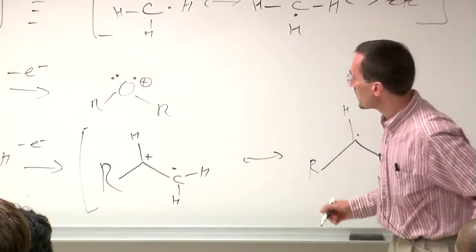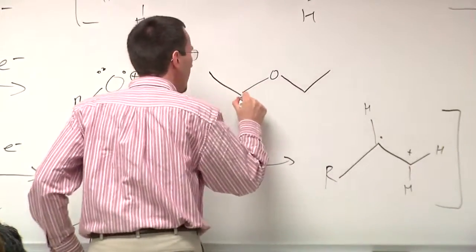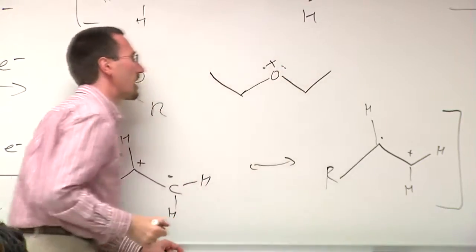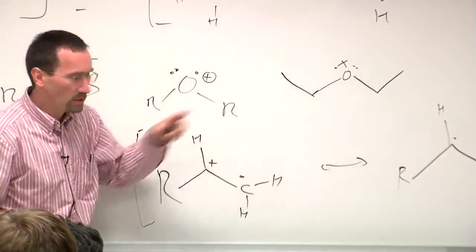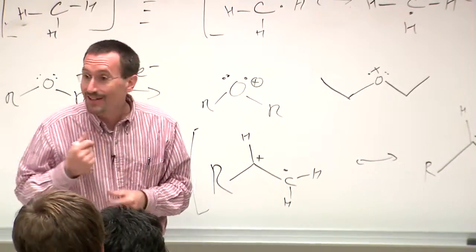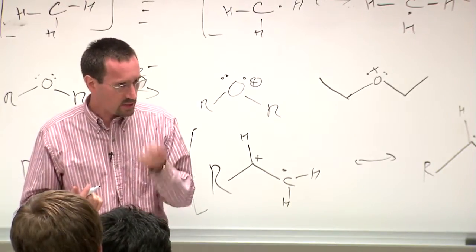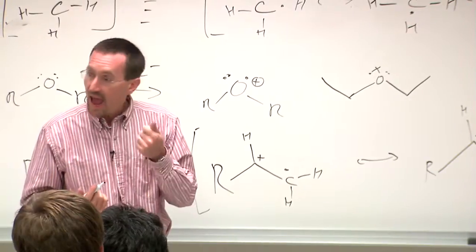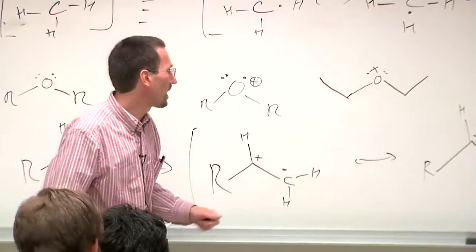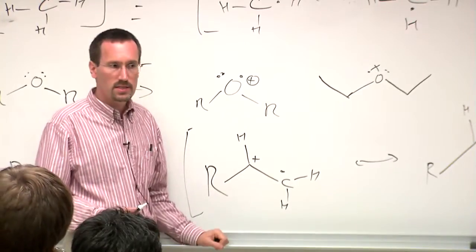So for example, later on we're going to see that if you have an ether like, I'll make it simple, diethyl ether, and this molecule breaks apart, because when you give it a whack with an electron, you put a lot of vibrational energy. So you've done double damage to the molecule. You've decreased the number of bonding electrons, so you've weakened the bonds in the molecule. And you've put a lot of kinetic energy into the molecule in the form of the impact from the electron. So the molecule now is vibrating, it is hot, and it has a tendency to fragment.